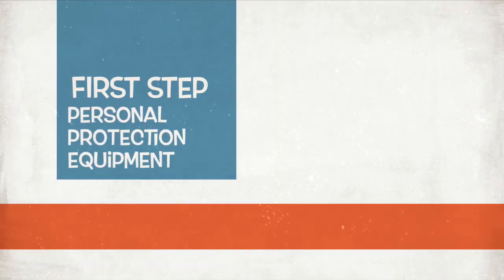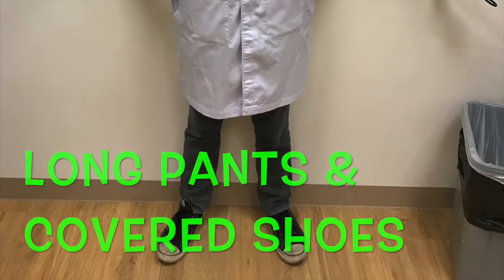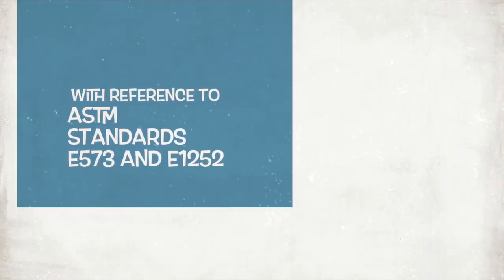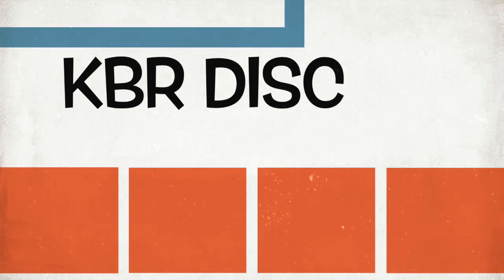Personal protection equipment. Before we begin, ensure that you are wearing lab coat and latex gloves for this particular experiment. Sample preparation. The following steps are done with regards to ASTM standard E1252 and E573 for ATR.